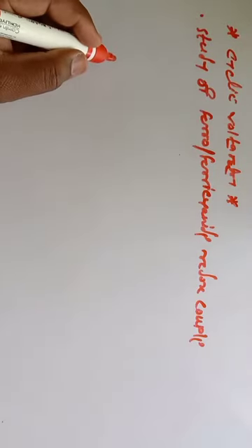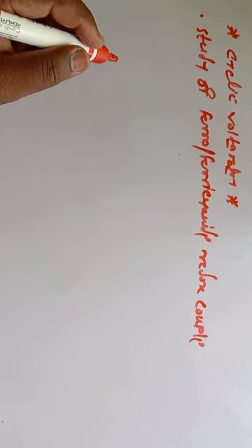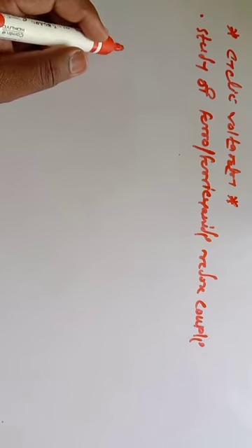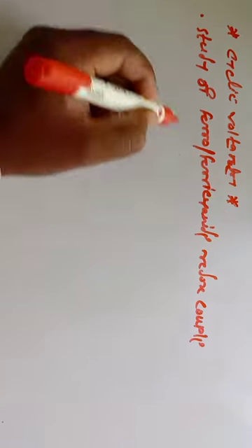Good morning, dear student. In today's lecture, we are very much interested in the cyclic voltammetric study of ferroferricyanide redox couple. This cyclic voltammetry is also known as triangular wave voltammetry.